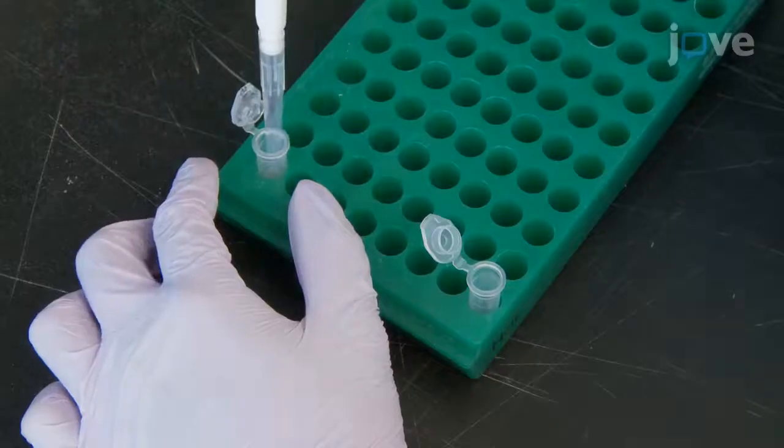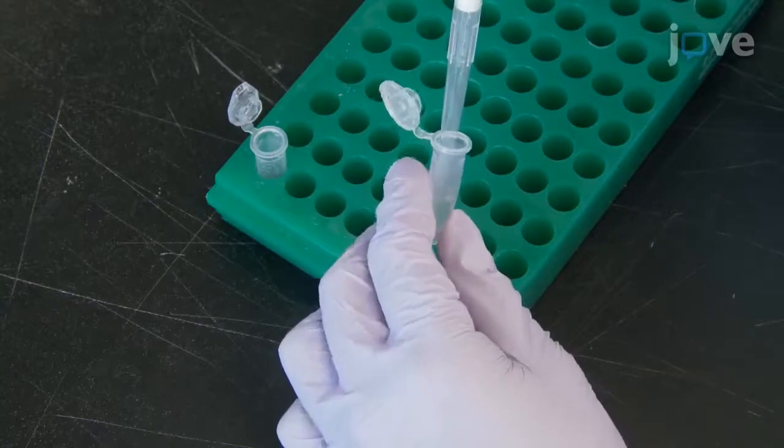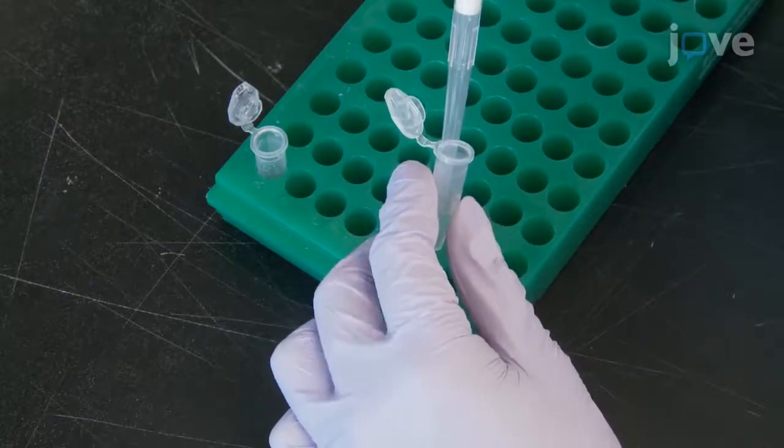After this, transfer 500 µL of the apoptotic cell and PBS suspension to the tube containing DMSO and NHS biotin.